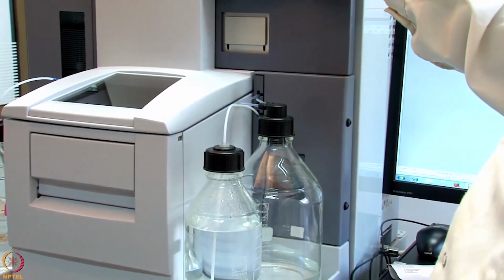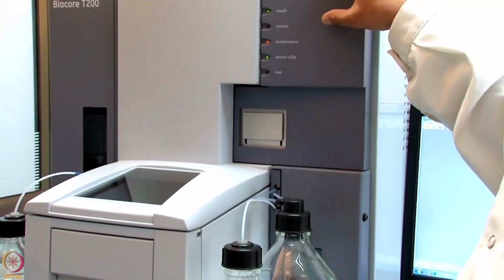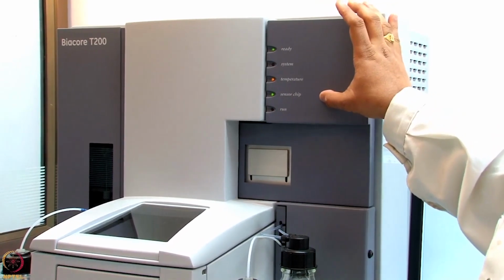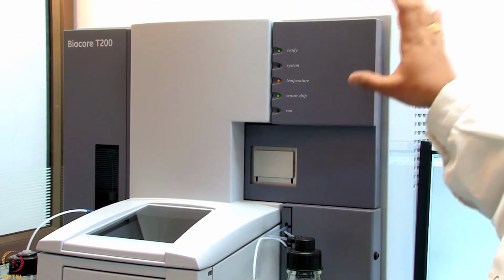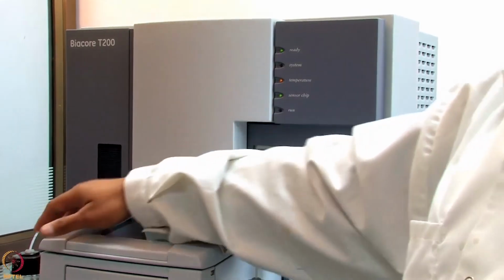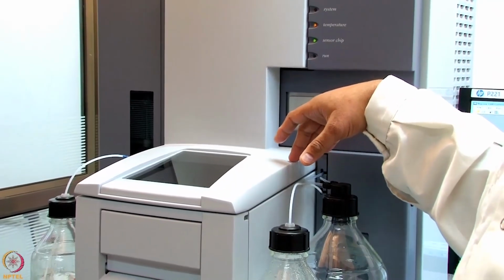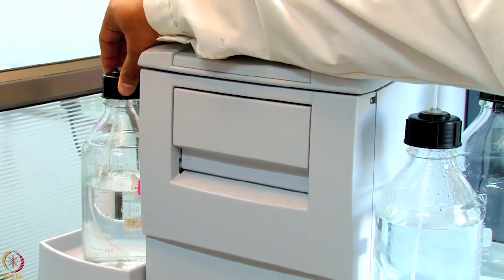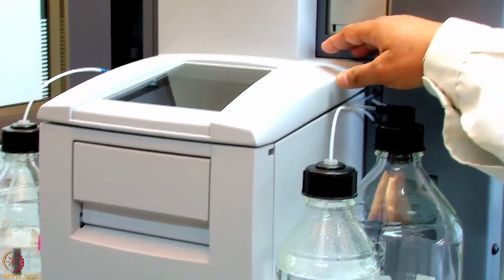Here, some indications are provided when the machine is ready, when the system is calibrating the temperature, when a new chip is docked, and when the run is actually happening. We will now connect a new running buffer here and prime the system before our immobilization experiment. So here the new HBS-EP+ buffer is connected and the new chip will be docked now.